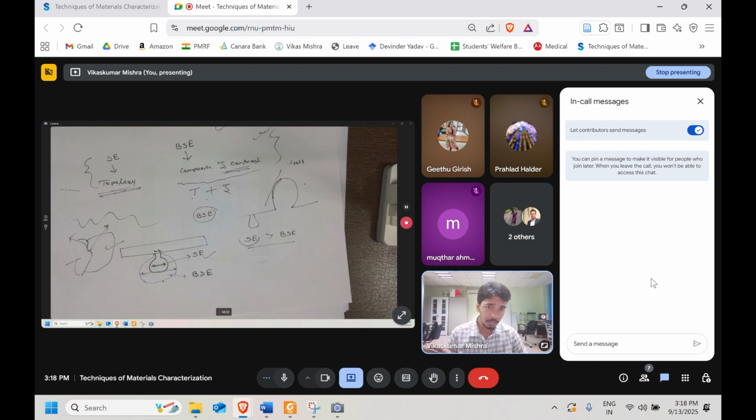Maybe we are changing the trajectory of the electron beam. Okay, so I'll do one thing. I will search for literature which says whether we tilt the specimen, or whether the disparities which already exist are the ones that contribute to the yield.